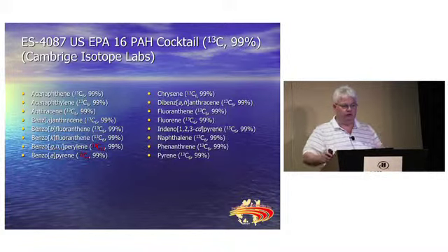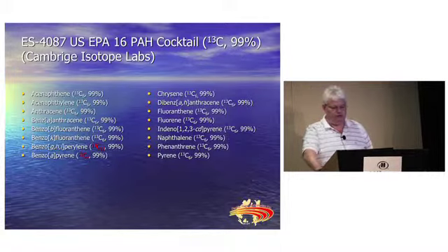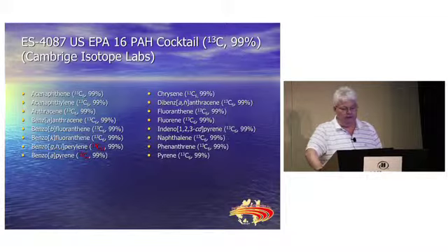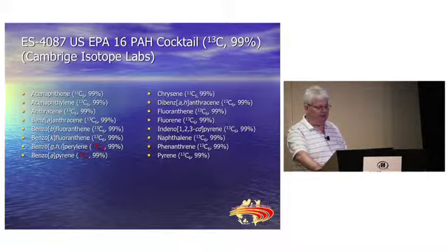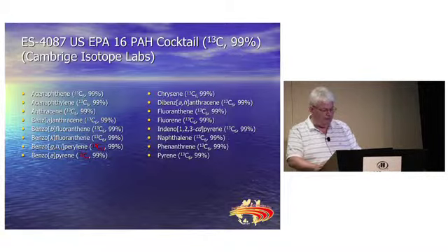So you get two very distinct chromatograms. Although they do separate on most chromatographic systems, this just ensures you got the right identification. Also with your benzo-A-pyrene, it has the same retention time as the benzo B and K fluoranthene. So you have another molecular ion to look at. These are all, one thing I'll talk about later, these 2 are at 99%.